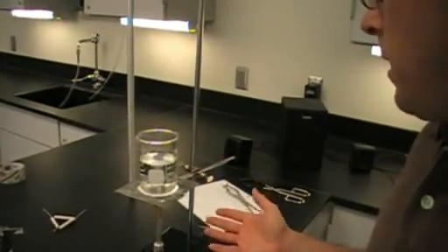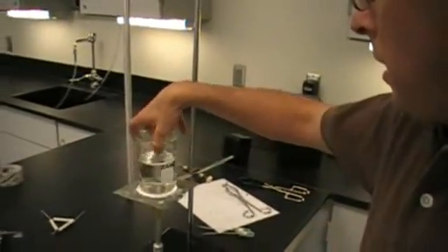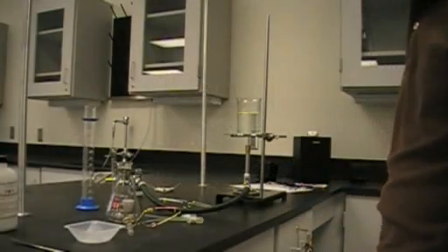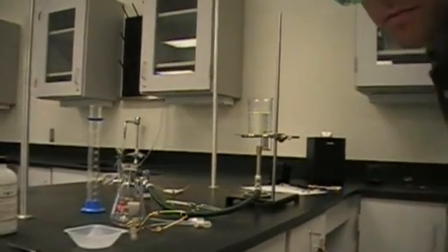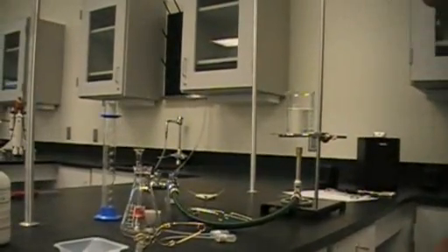I am going to get it started in heating. And once it is heated, I will kind of go over some other pieces of equipment. All right, now it's heating. We are not quite to boiling yet, but we are just going to see what the next step might be.